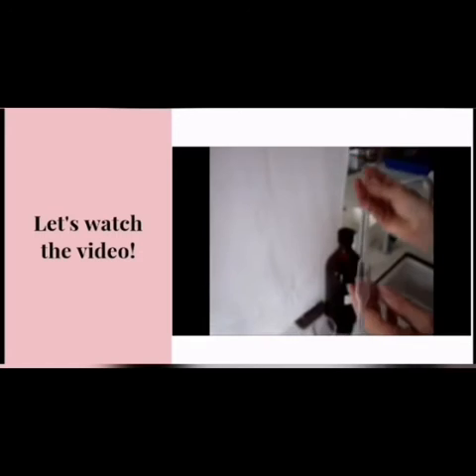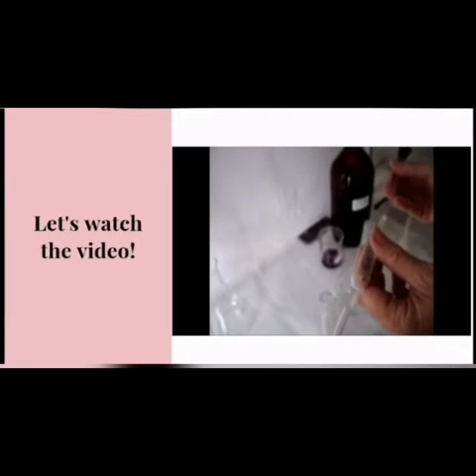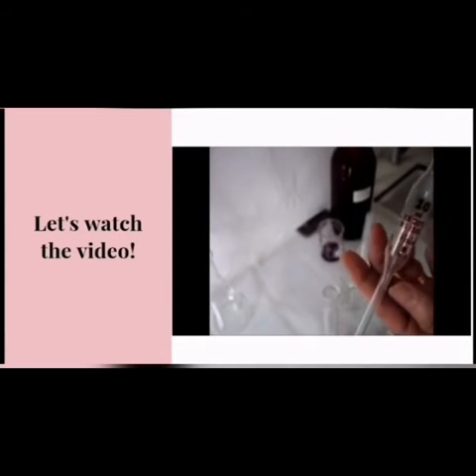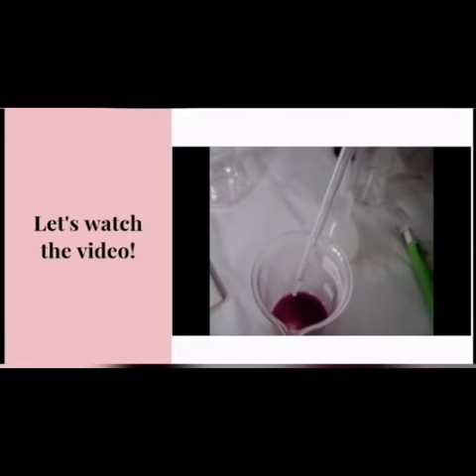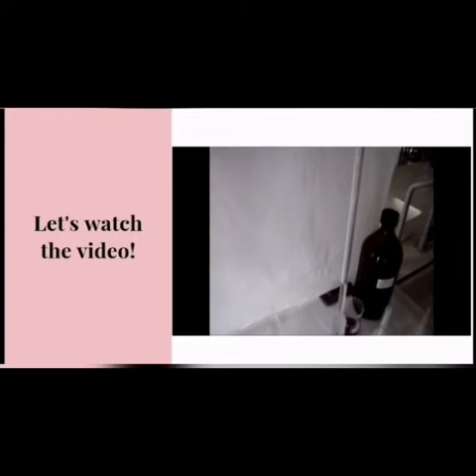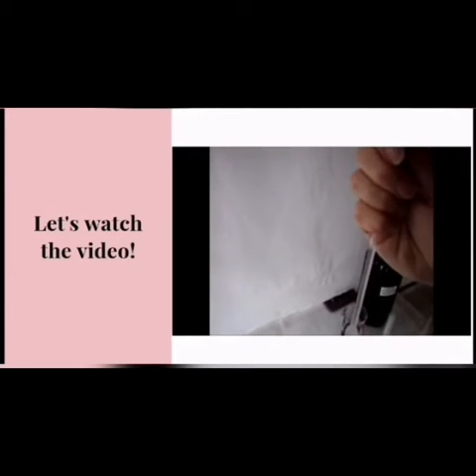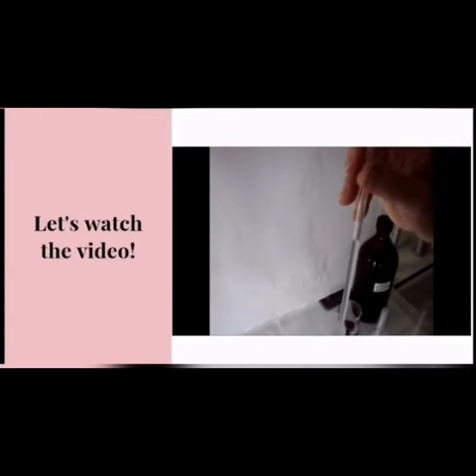The pipette was rinsed with distilled water and then with the iron solution. The pipette was filled until it was half filled. The pipette was rotated to ensure the inside was fully rinsed before emptying it into the waste beaker. Then 25 ml of iron solution was pipetted from part A into a 250 ml conical flask.